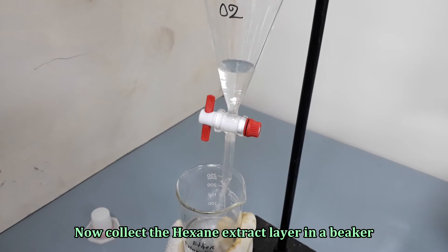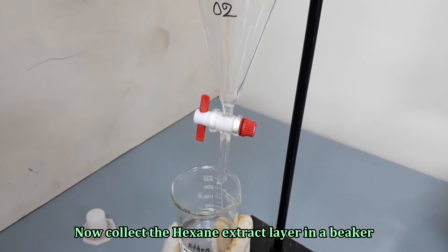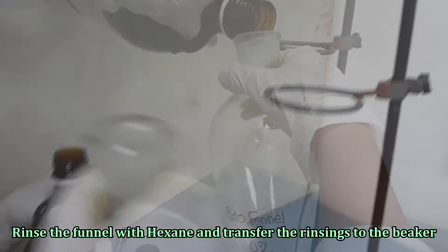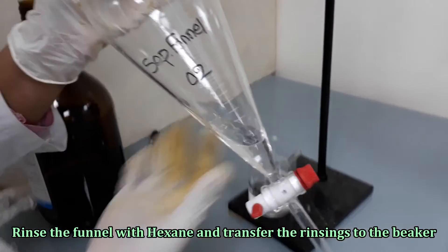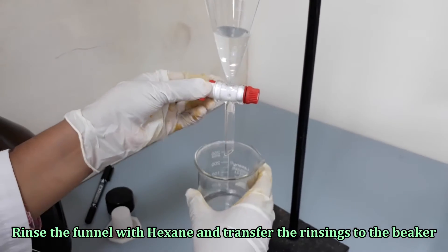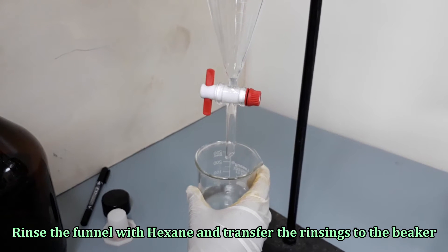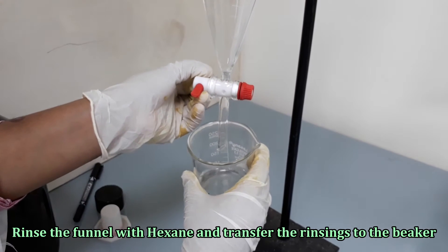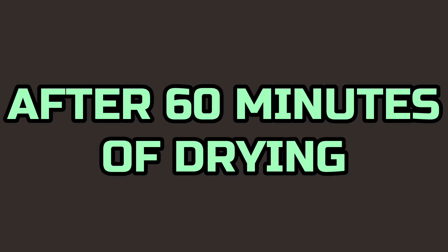Collect the water-free hexane extracts into a beaker, washing the funnel with n-hexane. Dry the extract in the oven at 90 degrees Celsius to evaporate the hexane until about 5 ml of extract remains.